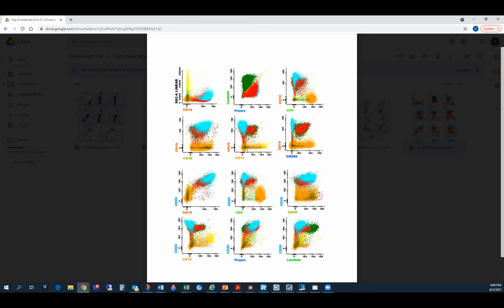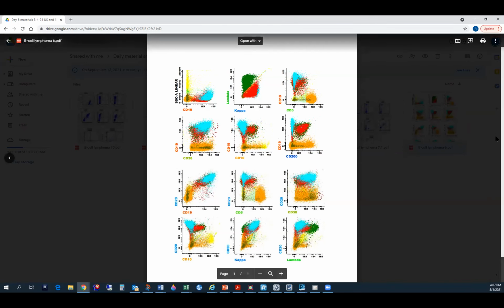Yeah. Okay, but hairy cell is usually positive for 200. That is one other place where 200 can be helpful, but it's not specific. It is usually positive, but again, you have to not rely on that, but correlate with your morphology and 103. But it gives you a hint. This was actually a marginal zone. Okay. Anybody has any questions?